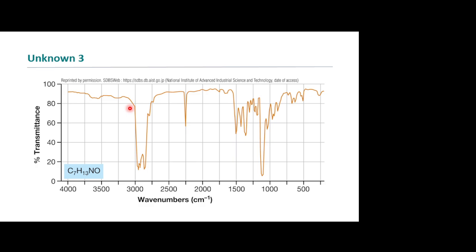Okay, so we'd go CH stretches, right? What's the frequency range for a CH stretch attached to a terminal alkyne? Yeah, very high, right? We don't have anything strong there, do we? So that can't be. So we don't have the terminal alkyne. The terminal alkyne is the only alkyne that's actually a relatively strong band. It's usually in the medium range.